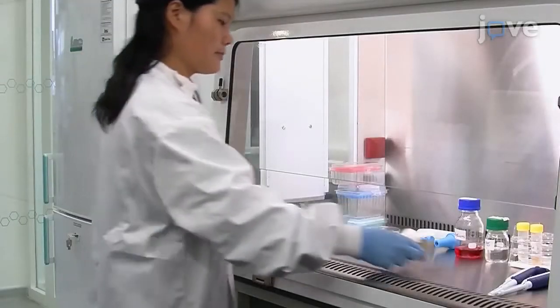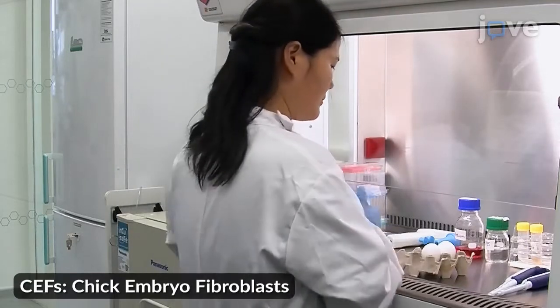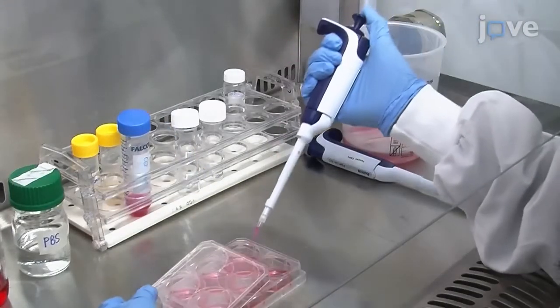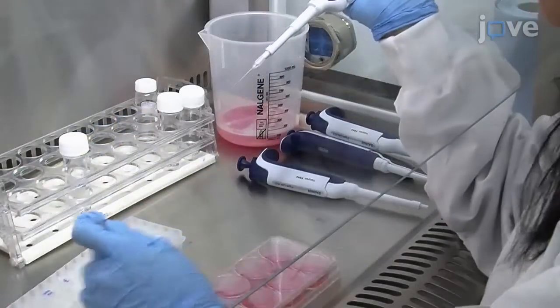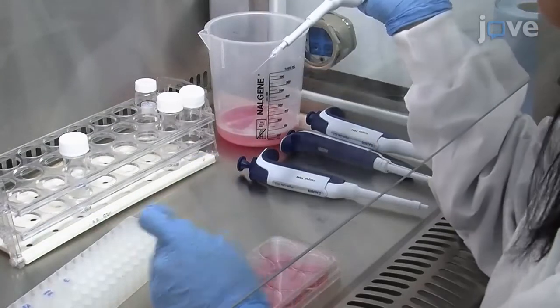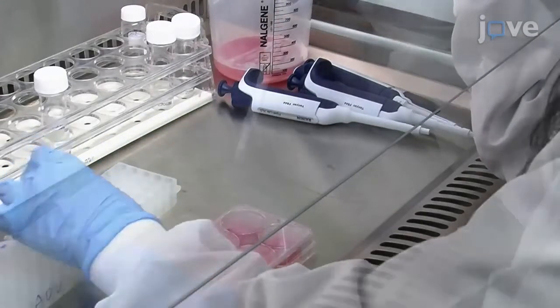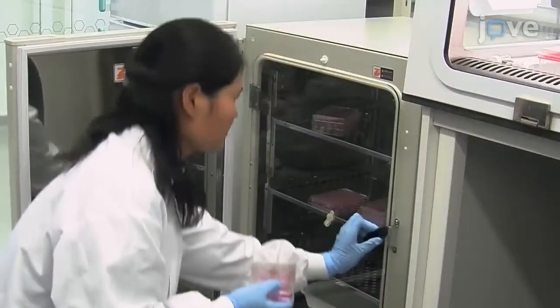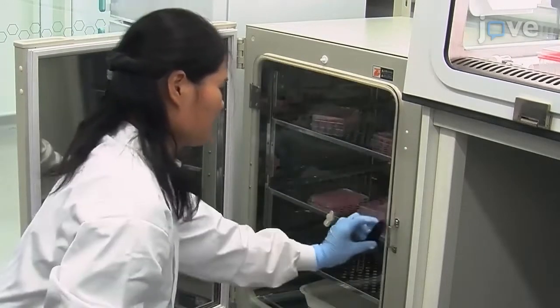The day before transfection, prepare chick embryo fibroblasts as outlined in the text protocol. Seed 1.3 million cells in 2.5 milliliters of medium into each well of a 6-well plate. Transfect the CEF cells with 0.5 micrograms each of the two Cas9 guide RNA plasmids and 1 microgram of the donor plasmid using an appropriate transfection reagent according to the manufacturer's instructions. Incubate the cells at 38.5 degrees Celsius with 5% carbon dioxide for 12 hours.